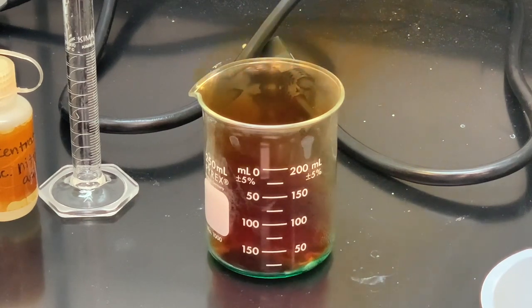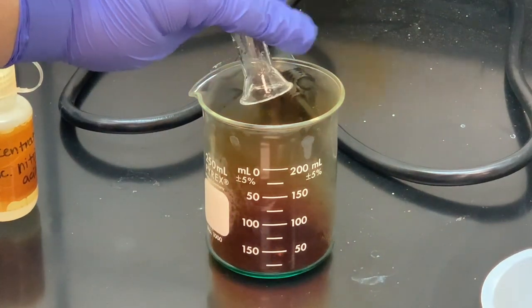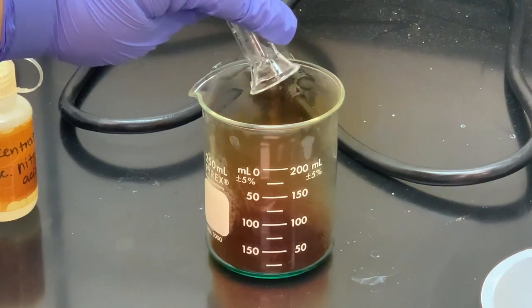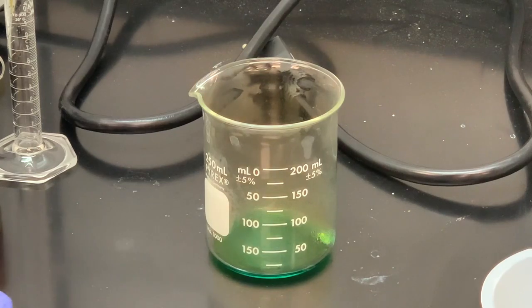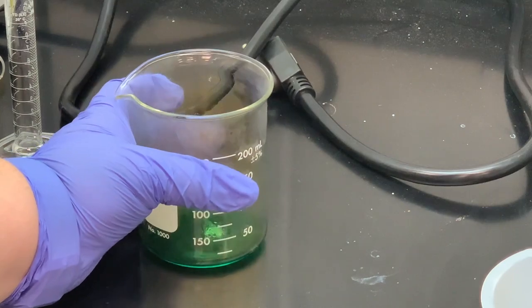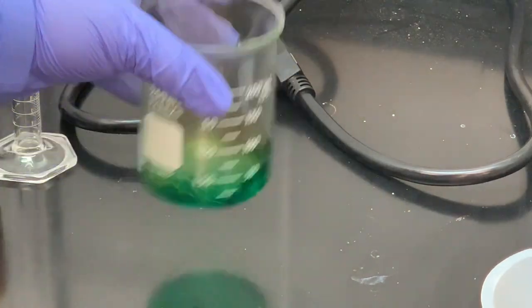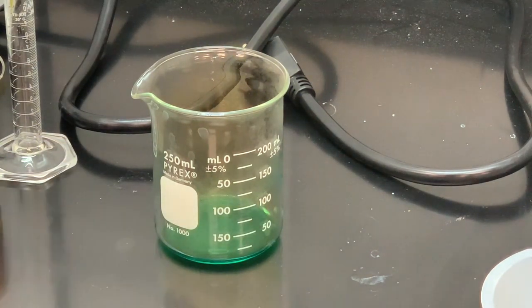Once this reaction subsides a little bit, I'm going to go in there and swirl it, just kind of stir it up to make sure that reaction does go to completion. I'm also going to see if I can get all that nitric acid into the beaker. Okay, so this is the reaction that you want to make observations about. I can feel that my beaker has gotten warm, so this is an exothermic reaction. And you want to make those observations on what you saw when I did mix that nitric acid with the copper.